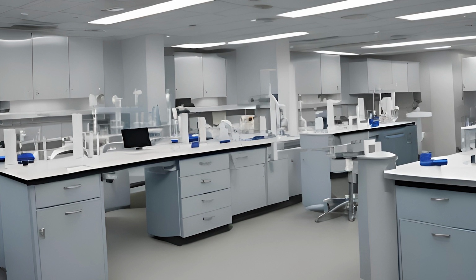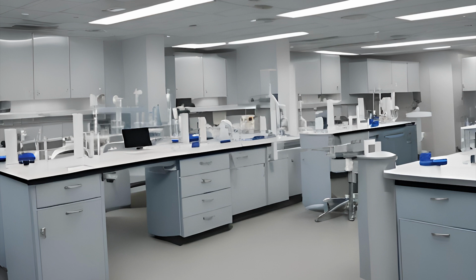I centrifuged the tube. I took the tube out of the centrifuge. I questioned myself, did I actually centrifuge this tube? I put it back in because I thought, I must not have hit the start button. I centrifuged it again, and I watched the whole run this time, pulled the tube out, and I couldn't tell that I had centrifuged the tube because the blood cells had released that much hemoglobin and iron into the fluid. I couldn't even tell where the fluid began and ended and where the cells began and ended. That's a bad day. That is a very bad day for somebody.